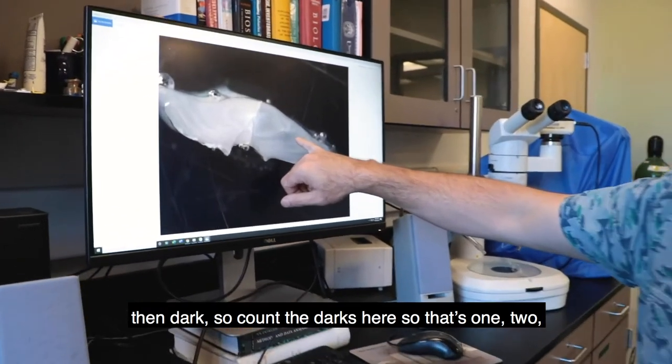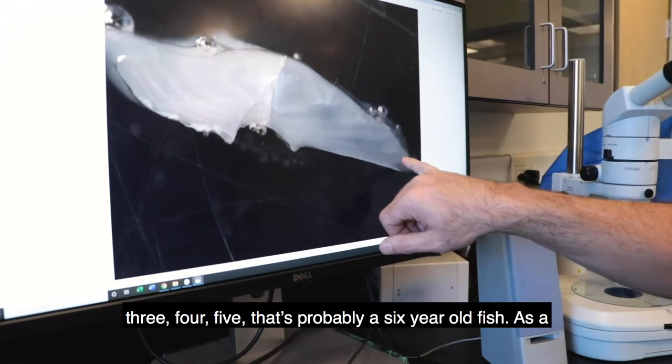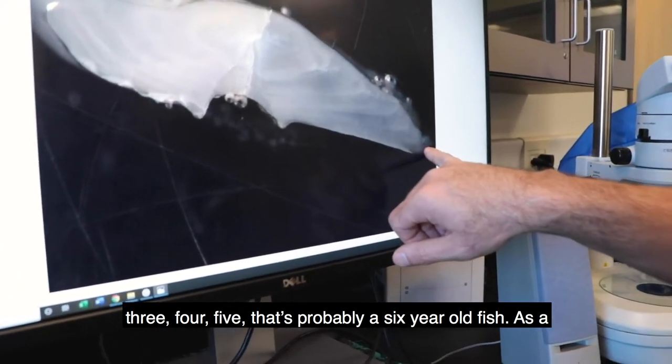So that's one, two, three, four, five. It's probably a six-year-old fish.